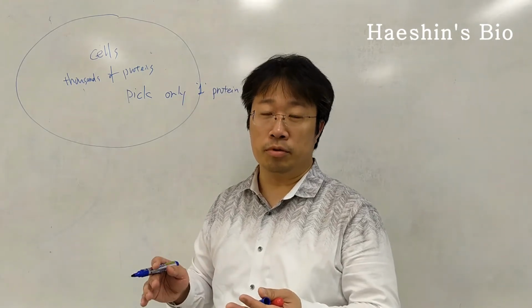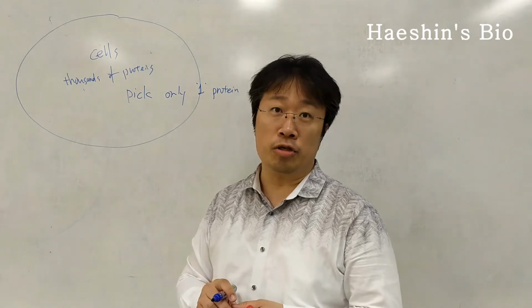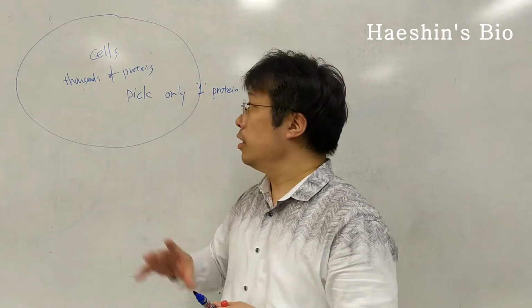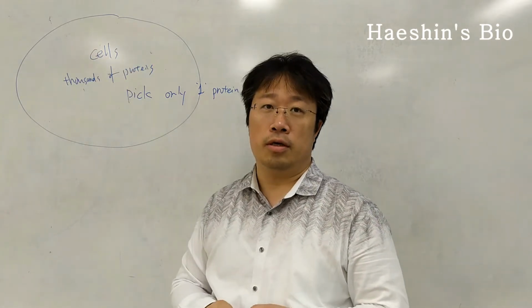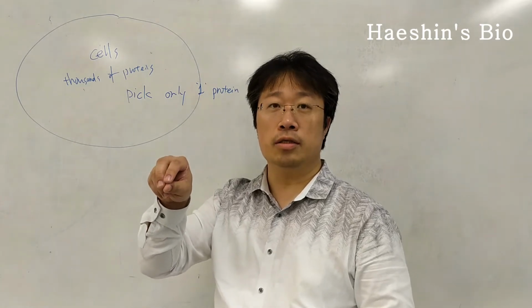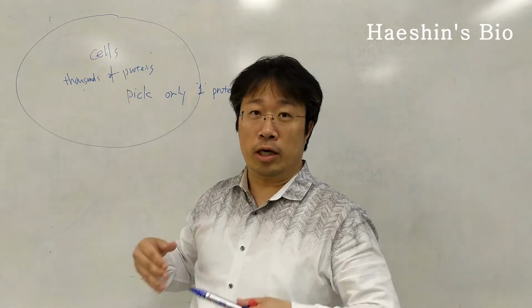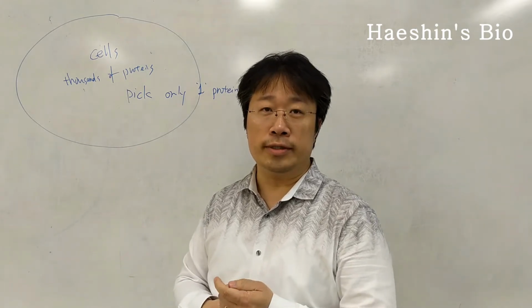Say the cells are producing a pharmaceutically important protein, for example insulin or growth hormone, EPO (erythropoietin), and many others. The cells are secreting and producing it in a large quantity, and among all these proteins, we want to pinpoint and purify the protein of interest.